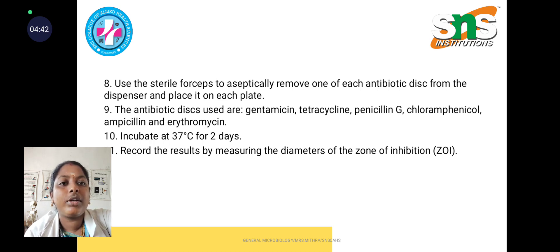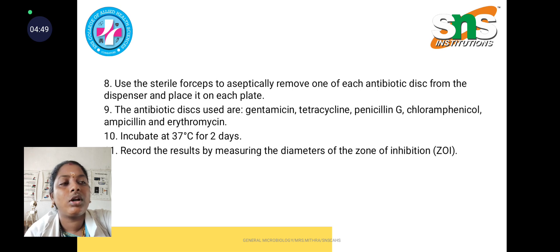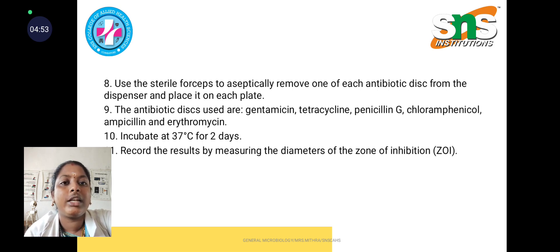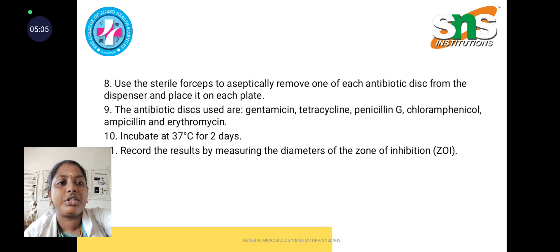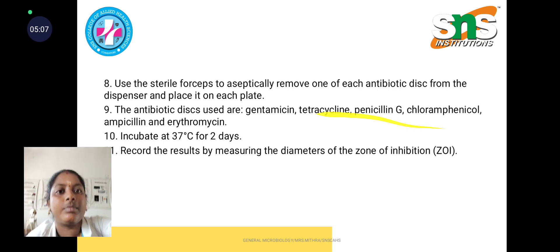The antibiotics used include gentamicin, tetracycline, penicillin, chloramphenicol, ampicillin, and erythromycin, or whichever antibiotics are being tested. Fix the antibiotic discs in the agar plate, then incubate the plate for 1 to 2 days. After incubation, record the results by measuring the diameter of the zone of inhibition.